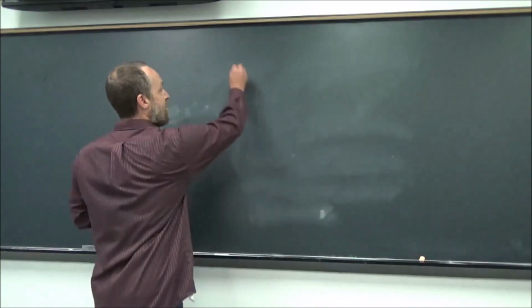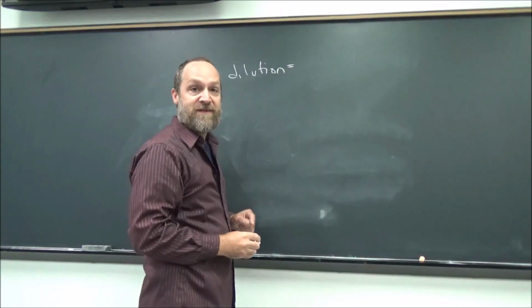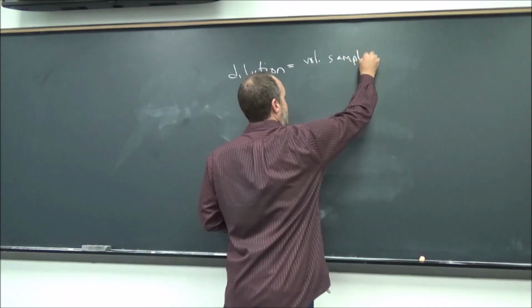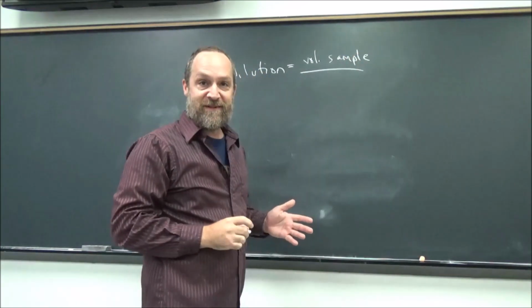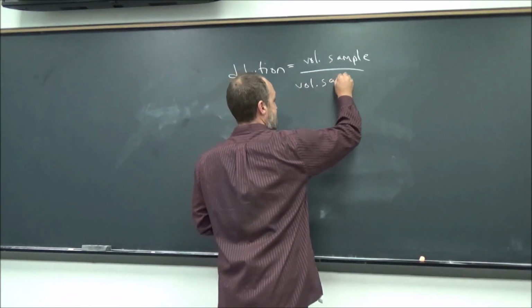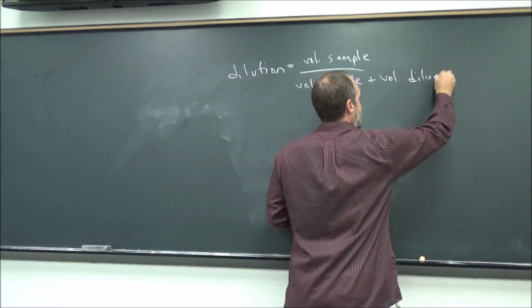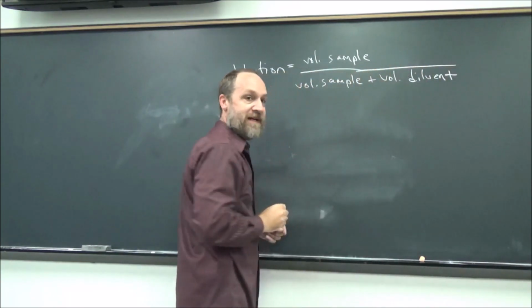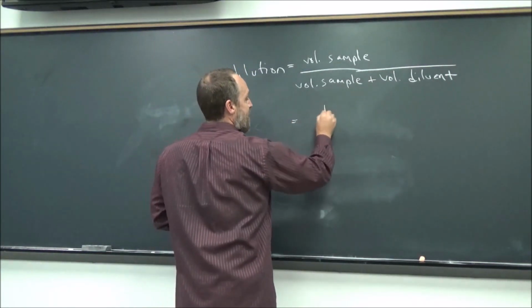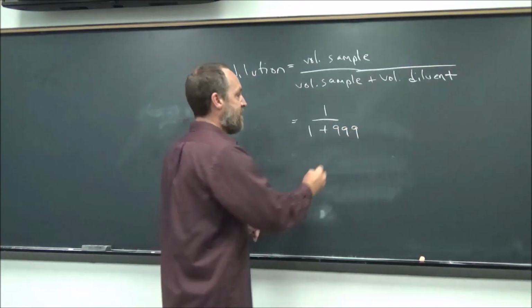So the dilution formula is dilution equals the volume of the sample divided by the volume of the sample plus the volume that it's diluted in. Okay, so again, we took 1 milliliter, added it to 999. So that's going to equal 1 over 1 plus 999. That's 1 over 1,000.